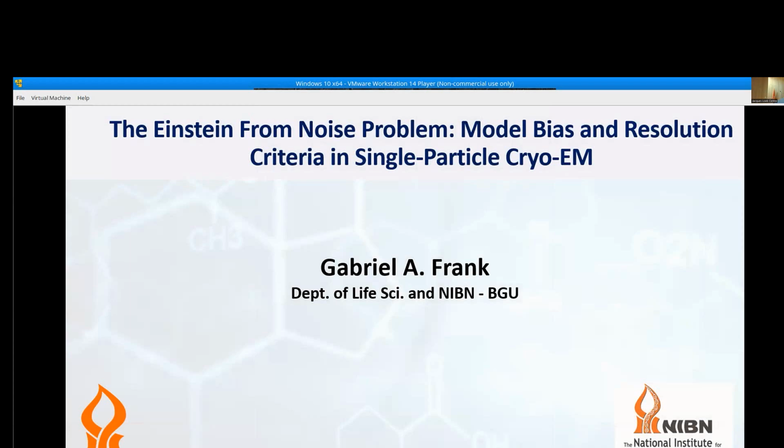However, when I heard about this meeting, it was very important to me to share my own experience from the field of cryo-EM on the issues related to reproducibility of results, and actually even one step further: how do you know that the experimental system that you are using provides meaningful data, and what assurances do you have?